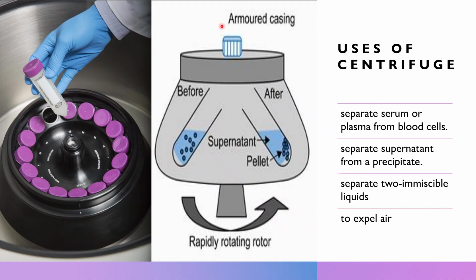Caring for the centrifuge in the laboratory includes daily cleaning of any spills or debris, such as blood or glass, and ensuring that the centrifuge is properly balanced and free from any excessive vibrations. Remember, balancing the centrifuge load is very critical.